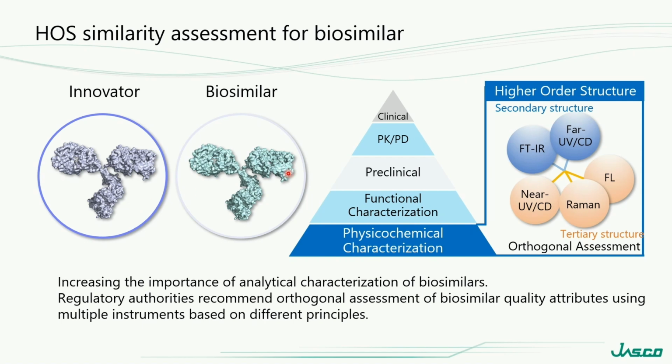Regulatory authorities recommend the orthogonal assessment of biosimilar quality attributes using multiple instruments based on different principles.